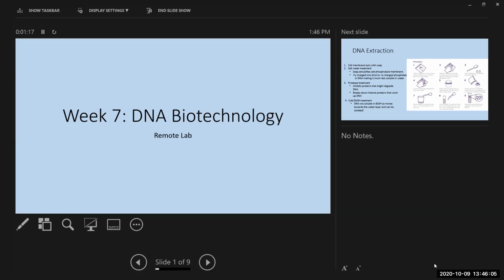We're going to be doing it specifically for a gene in TNF-alpha, tumor necrosis factor, which is involved in your immune response. So it's kind of cool, right? Some of you might have one version of the TNF-alpha gene and some of you might have the different version. So we're going to do this little experiment to see how it is virtually. All right, so let's get into it.